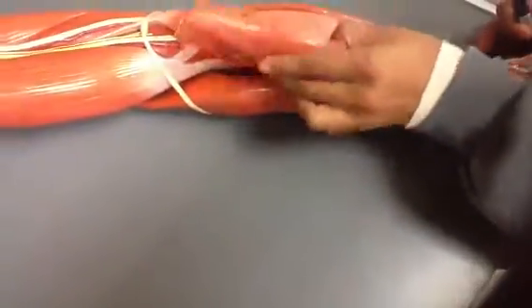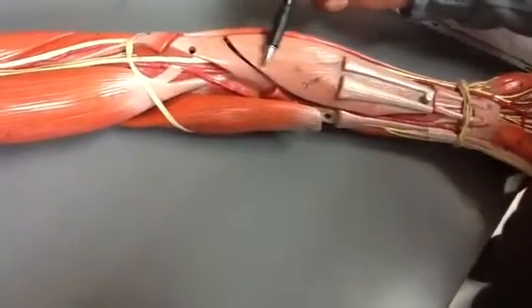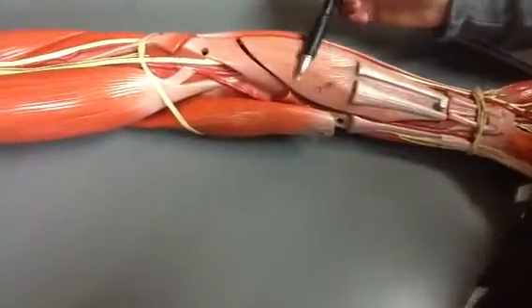If we remove the top layer, this is the intermediate layer, and this region right here is the flexor digitorum superficialis.